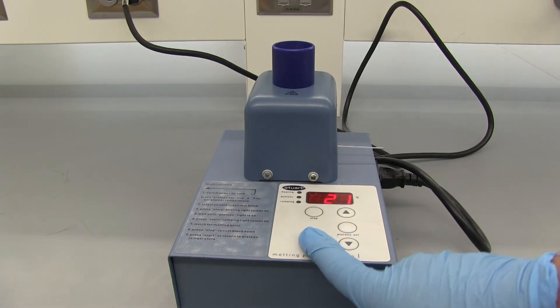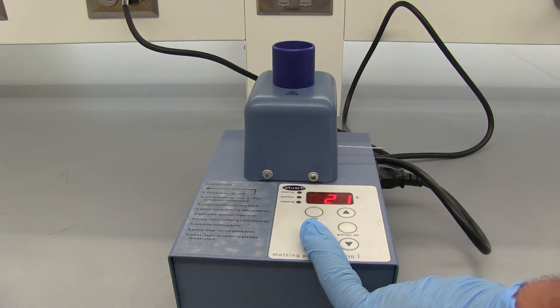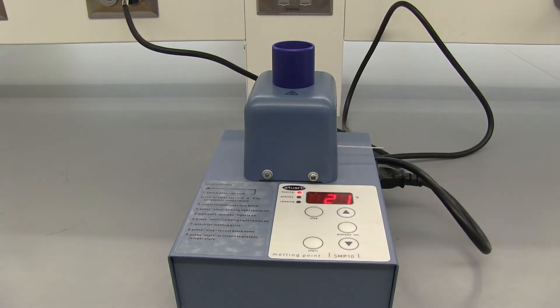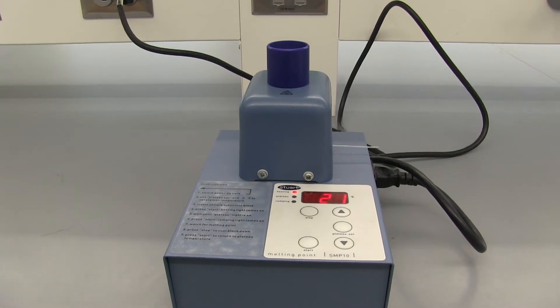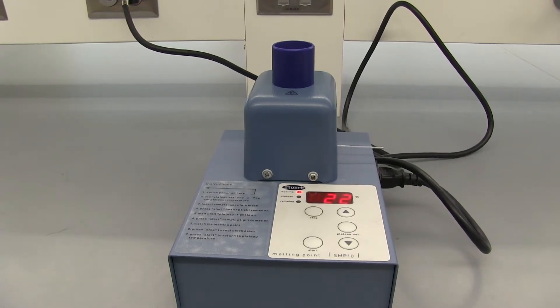In order to start heating we just press the start button. Once the red light comes on we know it's heating up and I will join you once we get our fast melting point. You just want to write the temperature that it starts melting at and the temperature that it fully becomes a liquid at.